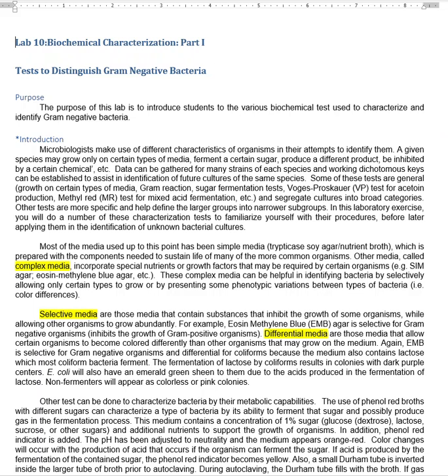The next thing I would have to do would be to gram stain it to characterize what it is. So say I've done that and now I've got a gram negative. How do I tell which gram negative this is? Well, the only way I can tell the difference between, say, E. coli and Pseudomonas aeruginosa is if I check them out with biochemical tests.